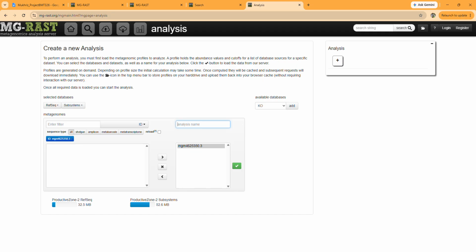But if you fail to analyze the data, meaning that if you wait for more than 15 minutes but it's still not moving, then the data has a problem, an error, meaning that the data is too old and it is broken, cannot be used to analyze.